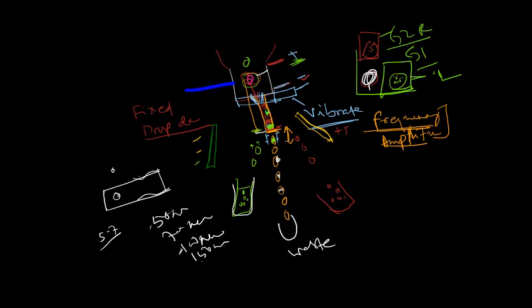While we are using this nozzle, we have to keep another thing in mind. On flow cytometers, we change the sheath pressure. On an analyzer, generally the sheath pressure is constant, whereas on a sorter we can vary the sheath pressure depending on the kind of nozzle that we are using. Generally a smaller nozzle will require a higher sheath pressure, and larger nozzles would require a lower sheath pressure.